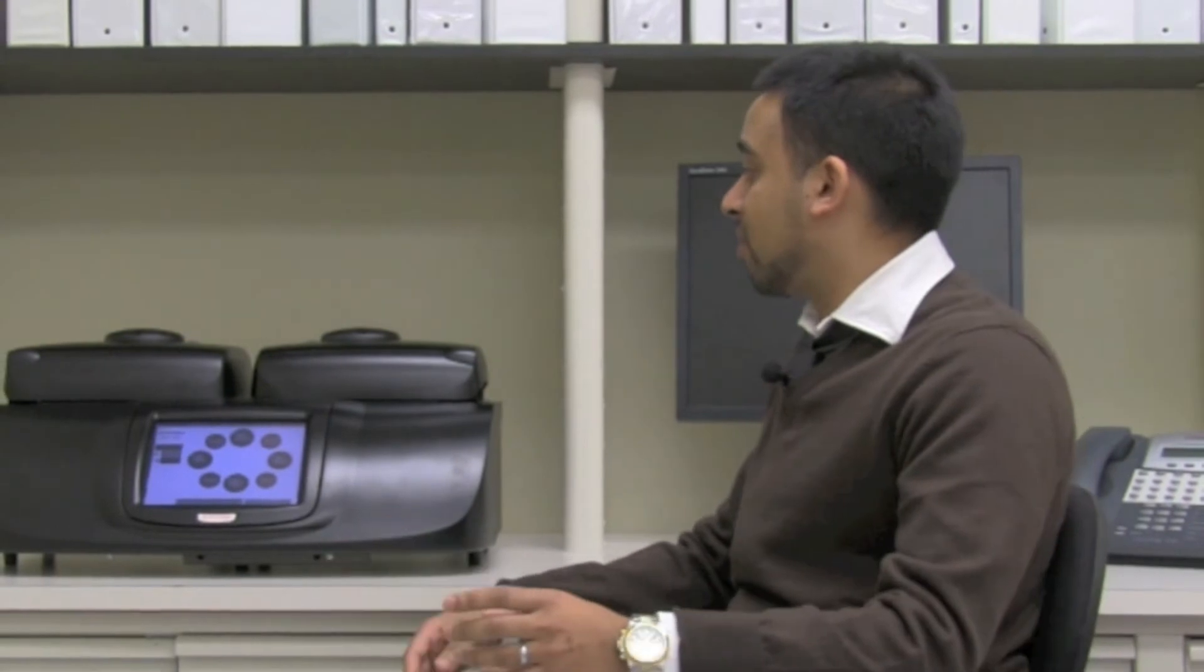If you're new to molecular biology, you might find programming a thermocycler, any thermocycler, quite a daunting process. That's not the case with the G-Storm. That's mainly thanks to the onboard software. Anyone should find the unit intuitive and easy to learn.